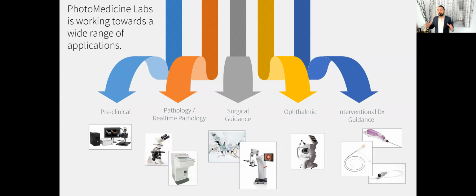So far, what I showed you were the new capabilities of a novel optical imaging modality. As we can all imagine, we can now apply that to several different applications, from preclinical applications to pathology or histology, which I'm going to explain soon. We can use this for surgical guidance, and for eye imaging, ophthalmic applications. Now, because we do not have this bulky transducer, the footprint is going to be very tiny. We can use it for endoscopic applications.